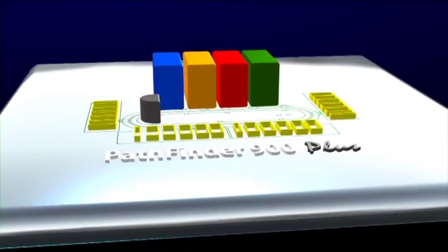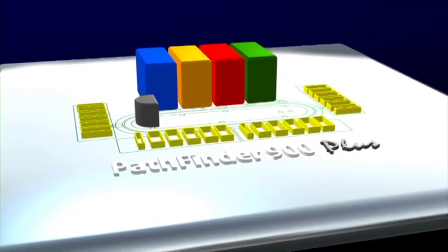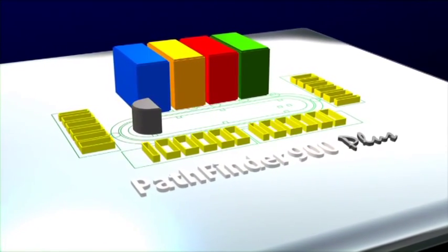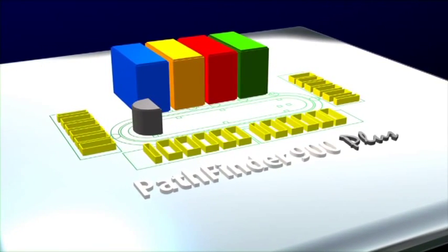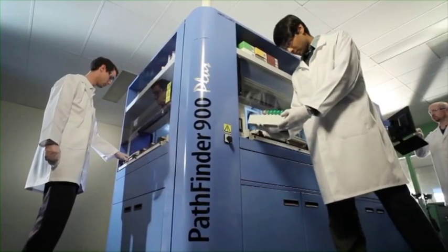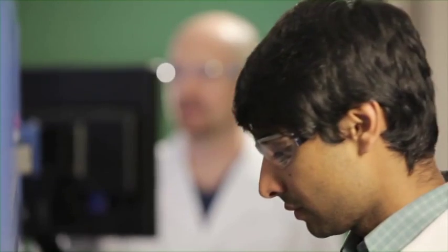The samples are loaded and unloaded onto the system from the front and both sides, allowing several users to access the instrument at the same time without getting in each other's way.